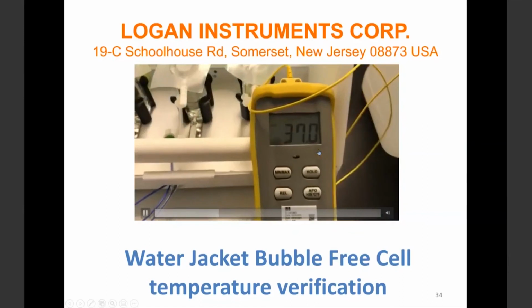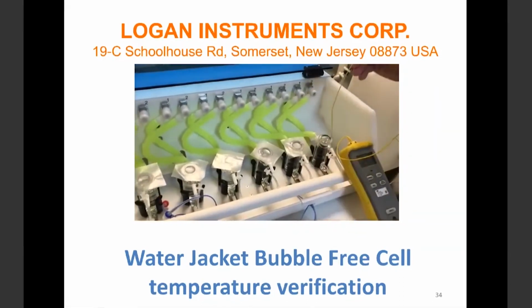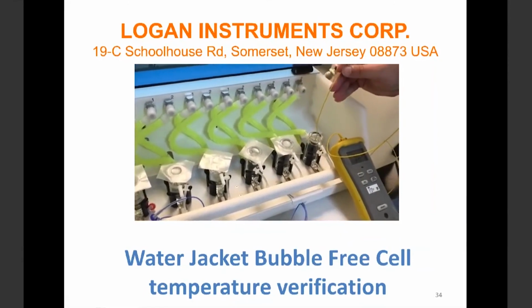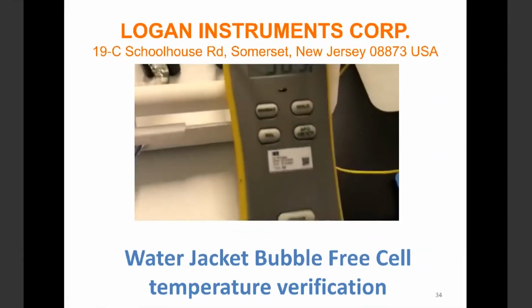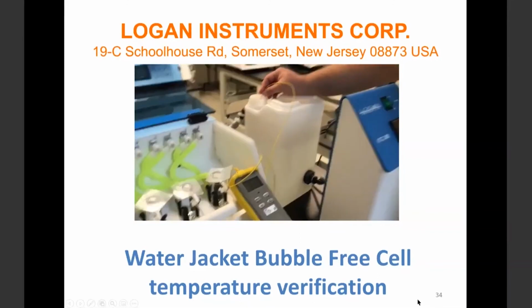So during the test, right now it's showing the water temperature, 37 degrees C. Now you put it into the cell. Now you can see the cell temperature is at 37 degrees C. So during the test, there's no sensor in the cell. So what we do is you can take the temperature measurement from the water tank, then it will be the same temperature. So here we show again.